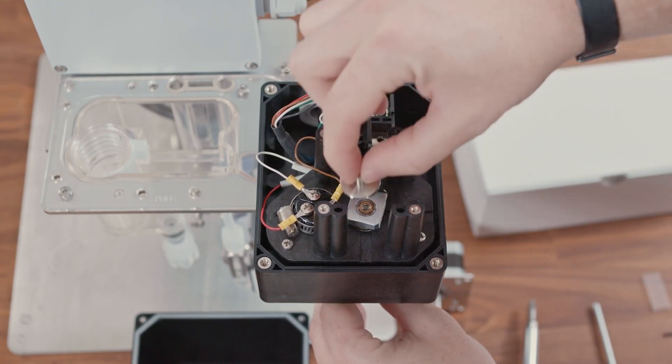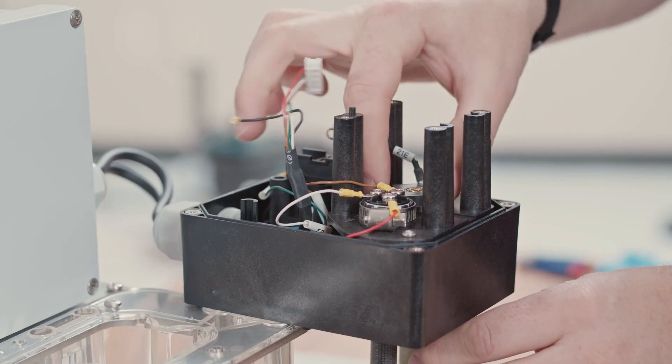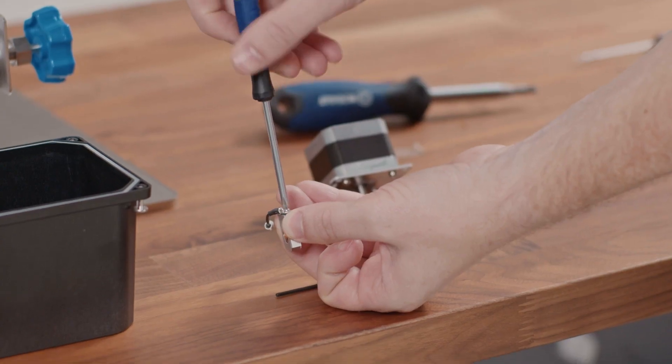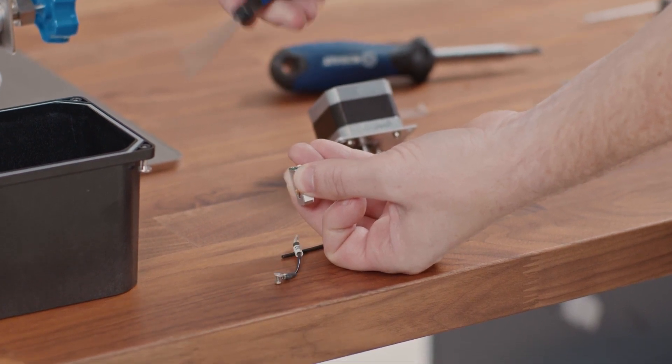This will now expose the rotating contact. Use the plastic pieces on the side of the contact and lift it straight off of the drive shaft. With the contact removed, you can now transfer the wire attached to the contact to the new rotating contact.